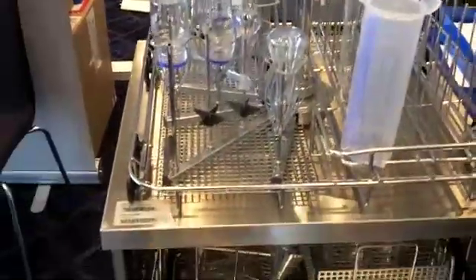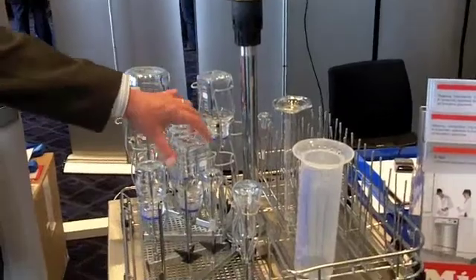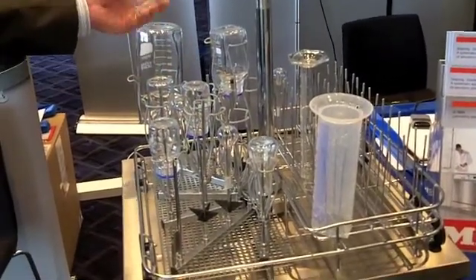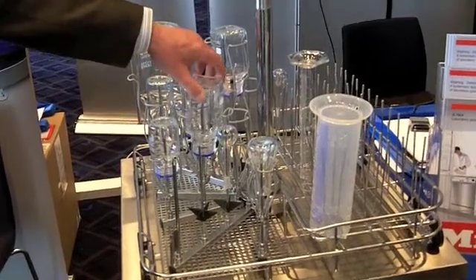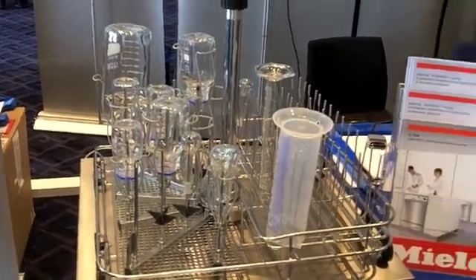We do models that have forced air drying with HEPA filters, and of course the air will also reach through the injectors into the glassware, making sure that it's reproducibly clean every single time.